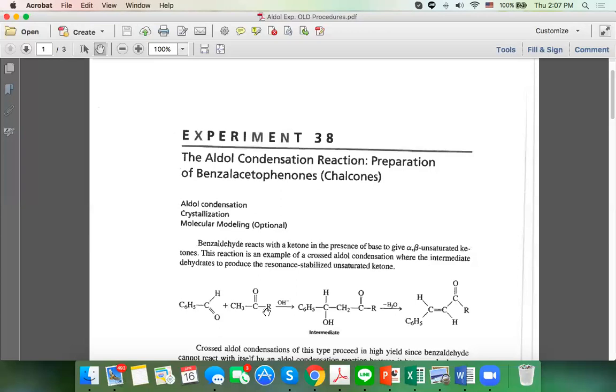And so look at the reactant side relative to the product right here. I'm showing you a product, okay, after this intermediate right here. The product right here is actually connecting the two reactants. And so let me tell you, this alkyl group, are you following my hand right here on this page, on the screen?